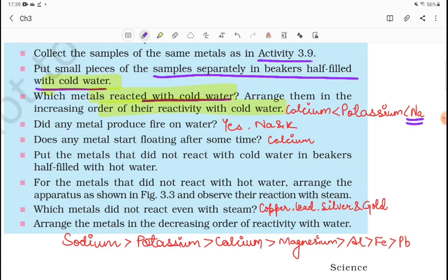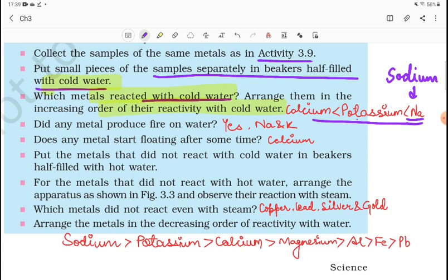Sodium is the most reactive in cold water. So calcium, potassium, and sodium are the 3 most reactive metals with cold water. We arrange them in increasing reactivity order. Did any metal produce fire on water? Also, calcium starts floating on water after some time.